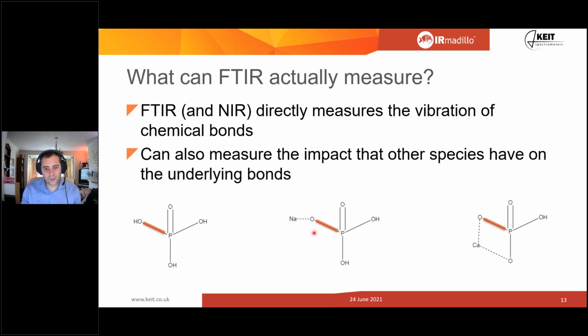And then the calcium over here, which is calcium 2+, is bonded to two at once. So now we've got the electron density being changed further, partially coming down to here. The size of the calcium is different as well, so that has an impact. So sodium versus potassium, even though they're both monovalent, they're both 1+ charges, have different impacts because they're different sizes. And they start to physically push the bonds out the way and things get moved around. And then the calcium as well, we've got contribution here, but we've also got a contribution here, and that again changes the electron density.